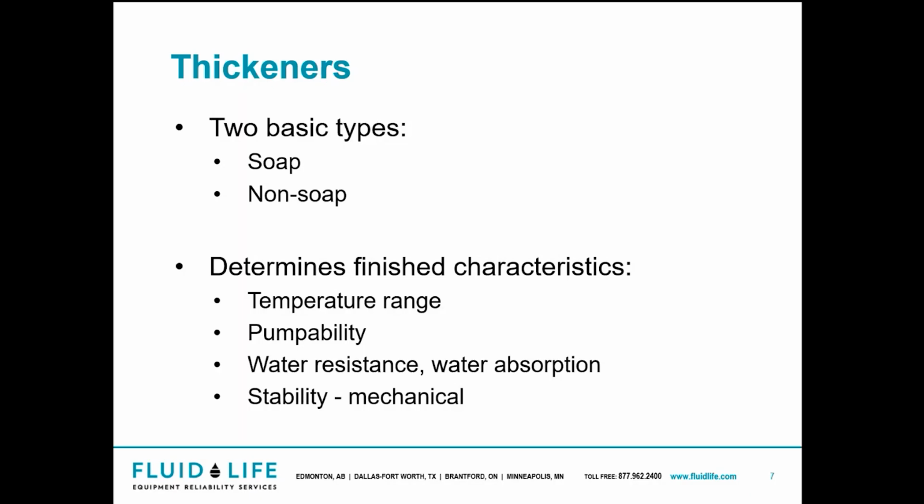Water resistance and water absorption. If you have an area that has a ton of moisture, it's going to need different types of grease thickeners. Also, the mechanical stability of it. Greases can absorb a lot of water and still maintain their effectiveness. However, water is still going to deteriorate the oil itself.